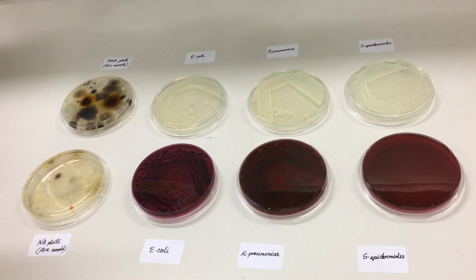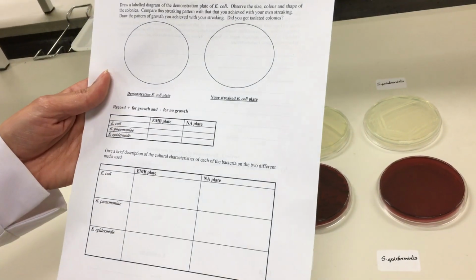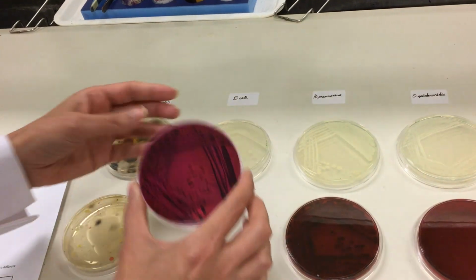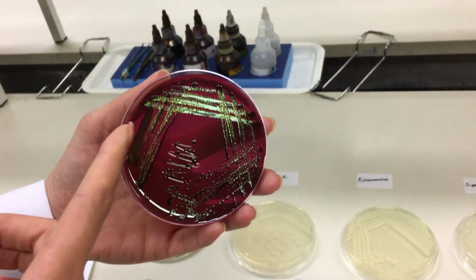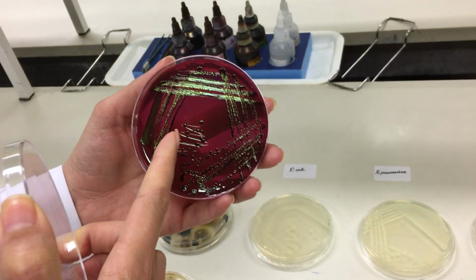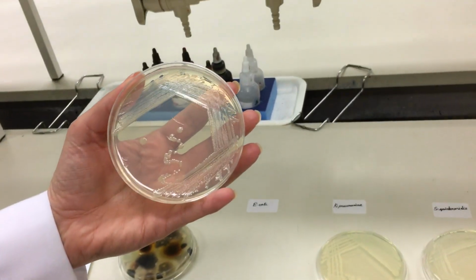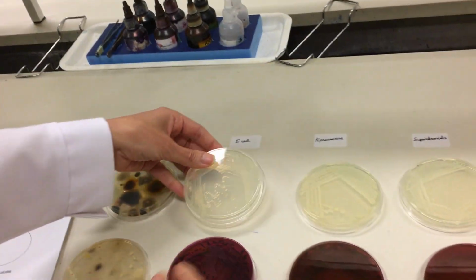So this is your expected result. So I go through this question. For the first question, you need to draw a good demonstration of the right streaking methods. So this is a good example, and that's for E. coli. So this is a good example of the right streaking. As you can see, the concentration A and B and C and D, and at the end the single colony in section E. That is the good example of the right streaking, the same as this one. So you're supposed to observe this when you come this week and draw the right streaking.